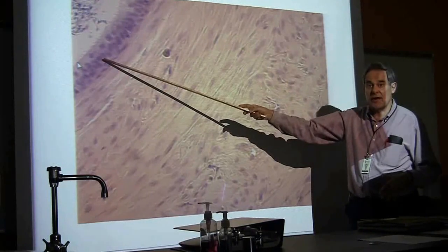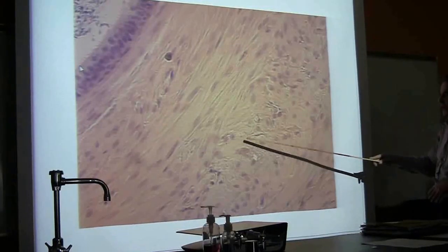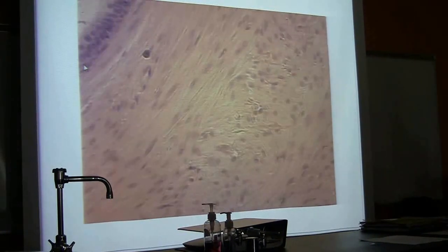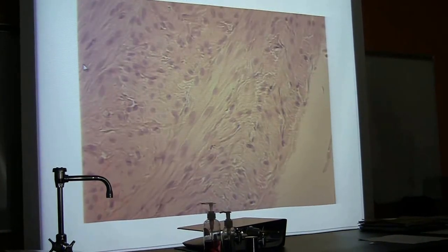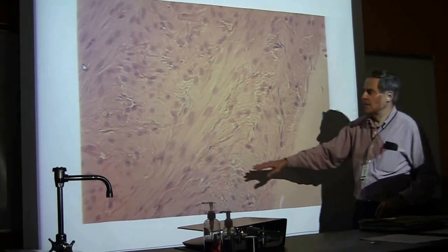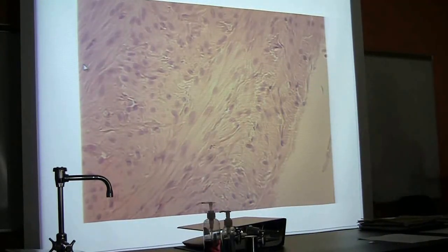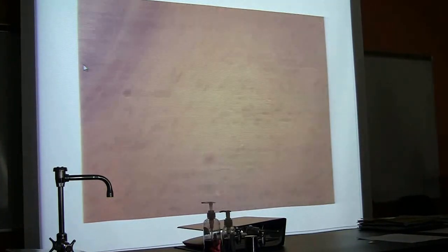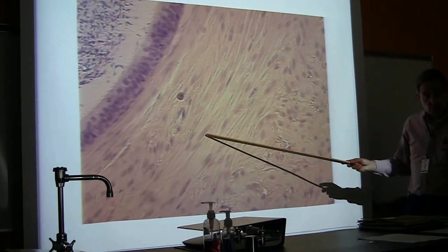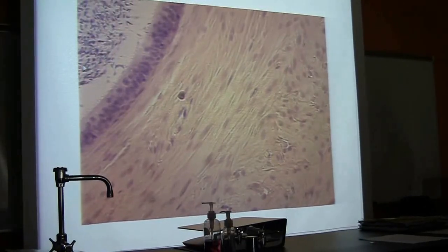Again, there's the epithelium, pseudostratified columnar, lamina propria, and the muscle layer: longitudinal smooth muscle, circular smooth muscle, and longitudinal smooth muscle. And again, if you get a pointer on this, don't give it the whole wall, just what it is. Out here you can see the outer part of the tube, it's longitudinal. In the middle, with muscle on either side, it's circular, next to the lamina propria. You can actually see the epithelium right in here, and again would be longitudinal. So type of tissue, smooth muscle; arrangement, longitudinal, circular, longitudinal again.